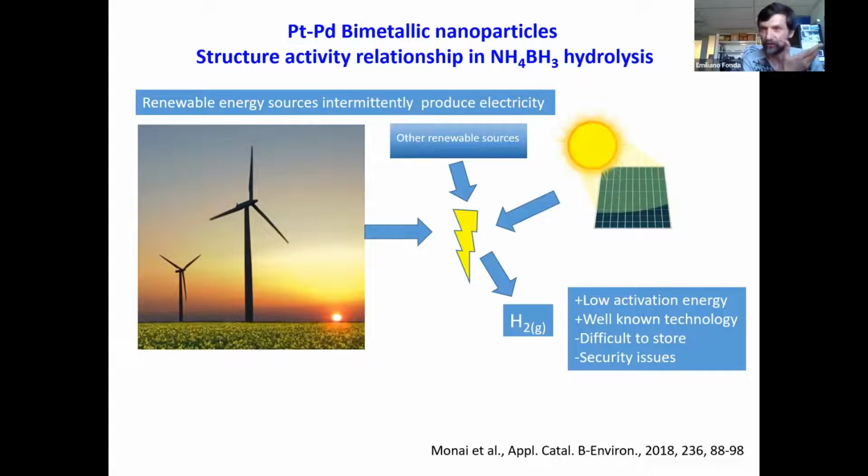Why do we do that when we can use a mirror? It's a historical question, and actually, from one point of view, the flux, the bender can really give the maximum flux. Do we need flux or do we need stability? We need both, but stability is probably more important. And what we would like is to forget the beamline and concentrate on many environments for catalysis, actually.